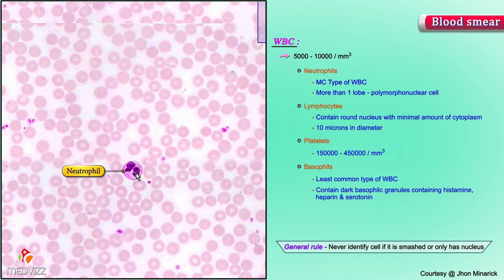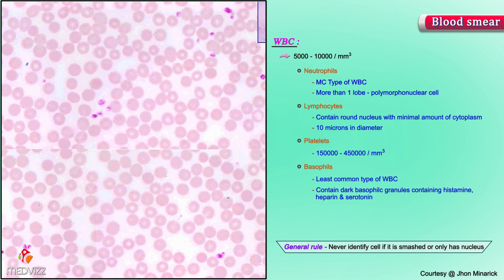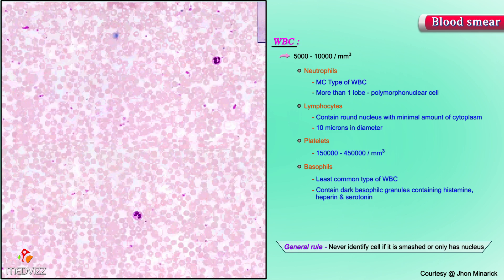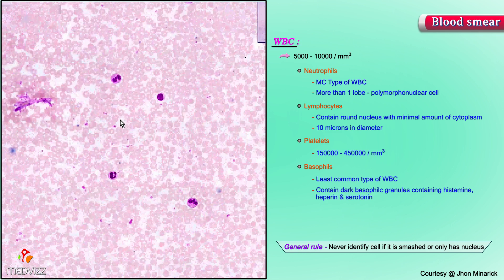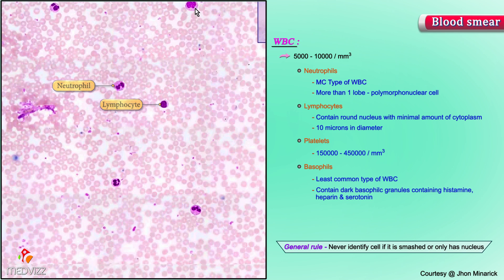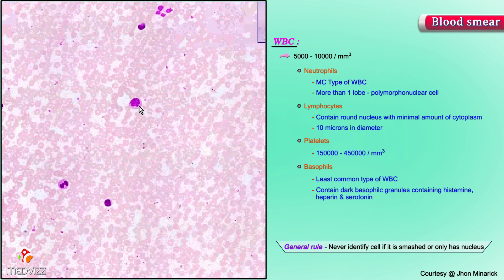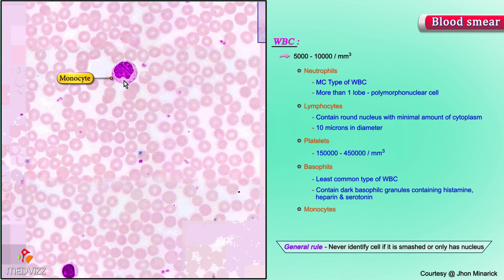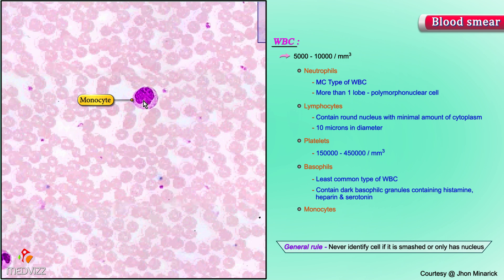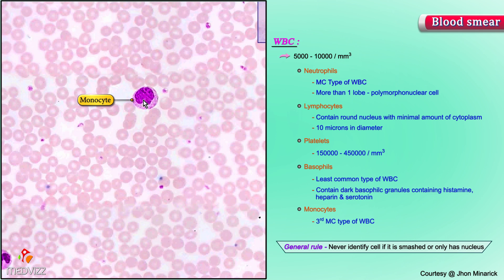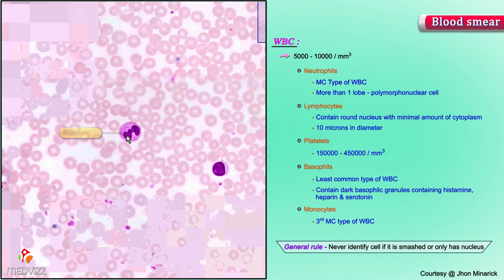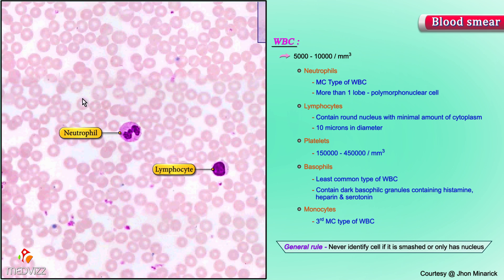Here is a granulocyte or a neutrophil. Here is another neutrophil. Here's a lymphocyte. And here's an interesting cell that has a somewhat convoluted nucleus, but it's not polylobed, and it has granules. This is a classical monocyte — the third most common type of white cell after the neutrophil and the lymphocyte.